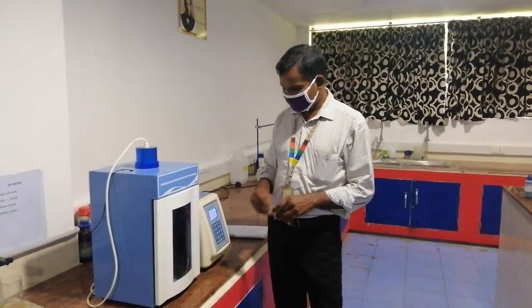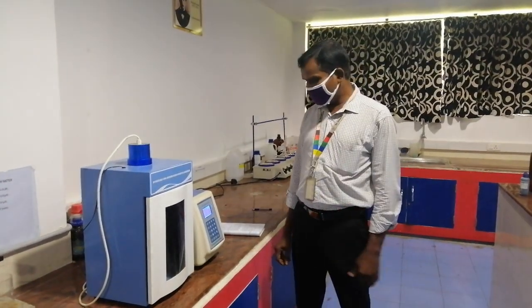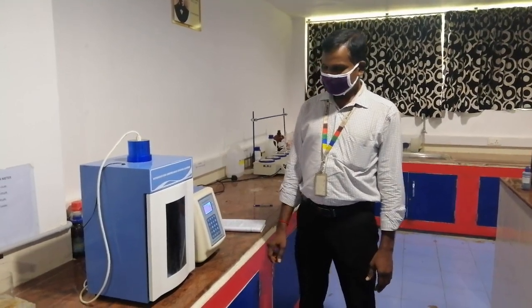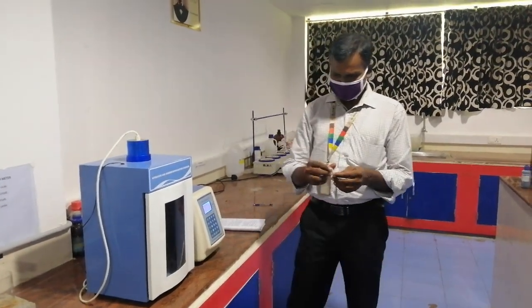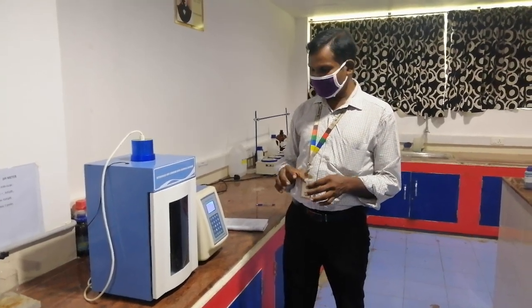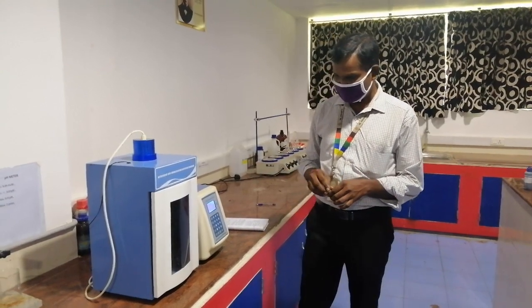In your first order equation, we have ln(1 minus C by C max) equal to minus Kn. Whatever the concentration of protein obtained after the first cycle, second cycle, third cycle are known as C1, C2, C3, C4, up to C10. And then we should know the C max, that is the maximum concentration of protein present in your sample when 100% cell disruption has happened.